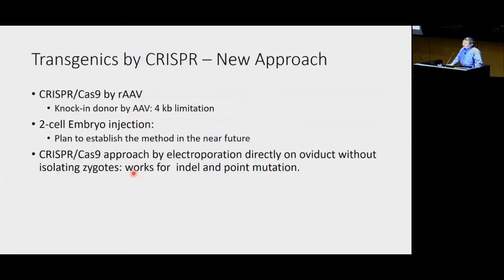No, I electroporate it. Oh, okay. My understanding is when you do electroporation, it works very well if the template is small, or if the template is RNA or single-strand DNA. When you have double-strand DNA, electroporation can be a problem and not work efficiently.